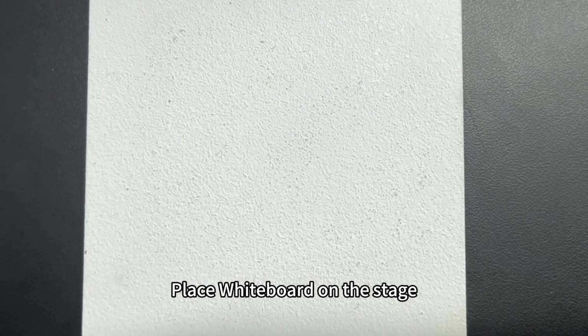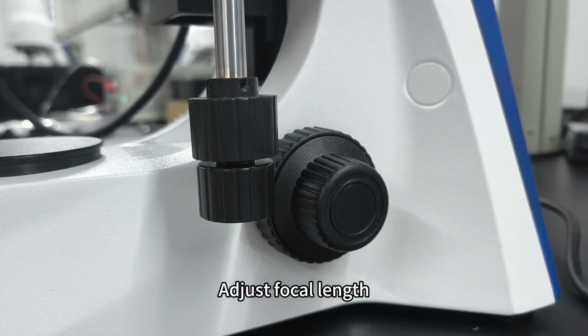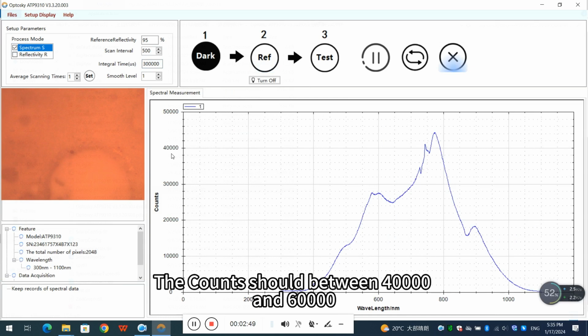Place whiteboard on the stage. Adjust focal length. Adjust to the best according to the software. Click Ref. The count should be between 40,000 and 60,000.